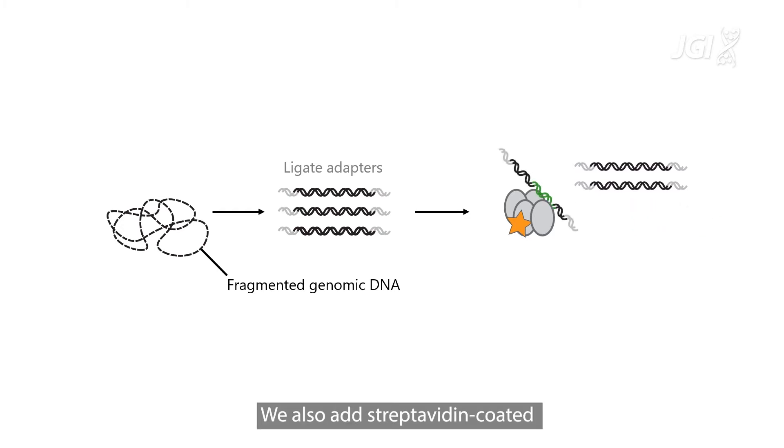We also add streptavidin-coated magnetic beads to the mixture. Since streptavidin has a strong affinity for biotin, the transcription factors along with their bound DNA fragments become attached to the magnetic beads.